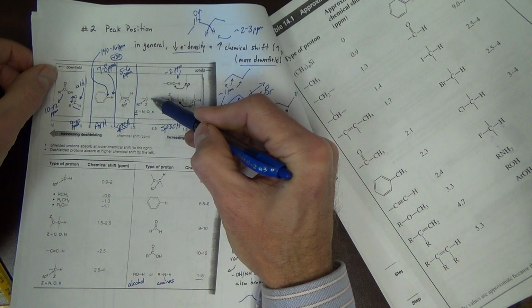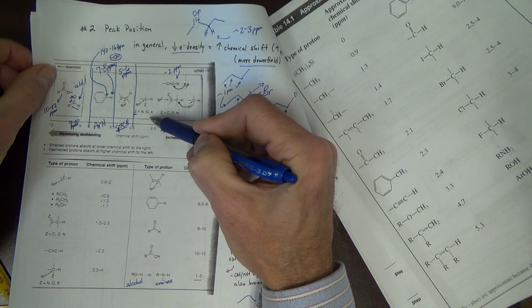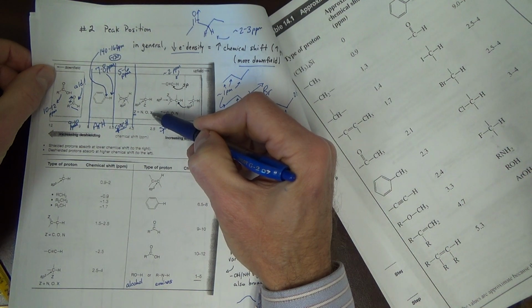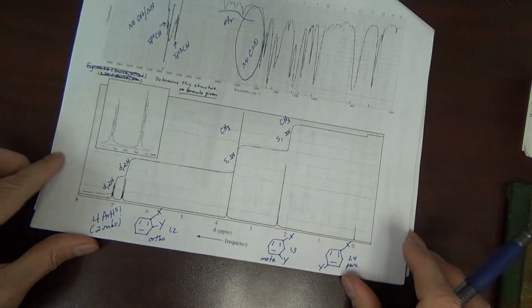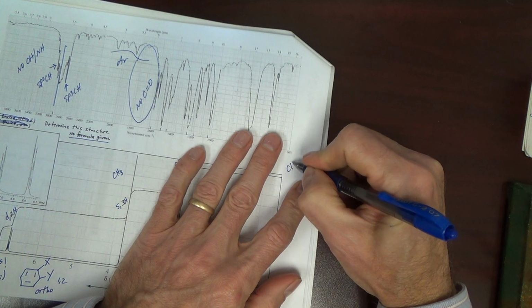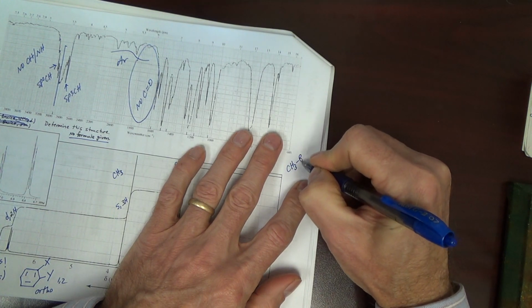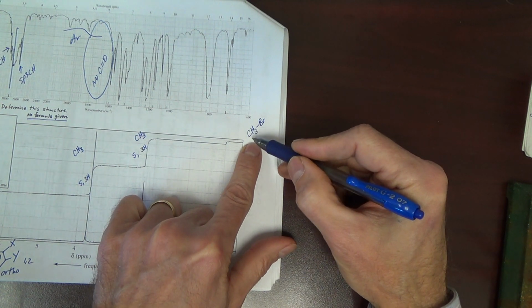The carbon with the H's must be bonded to some type of electronegative atom, such as nitrogen, oxygen, or halogen. Well, it's not halogen, because if it was bonded to halogen, you'd be done. Because there's no other room to bond anything else there.